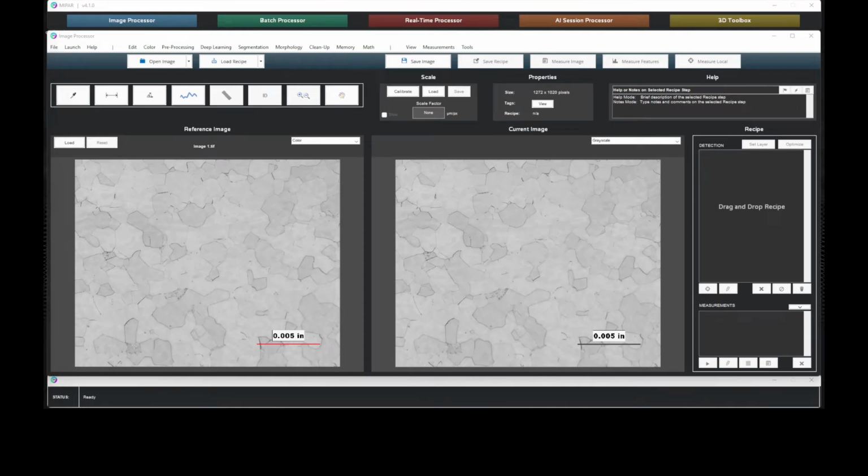When performing characterization of beta grain structure in titanium samples, the variable grain boundary contrast and background noise presents a significant challenge. As we can see, every grain has a unique contrast profile. In the past, the grain size information has been obtained using techniques like EBSD, which are much more costly than typical EM or optical imaging.